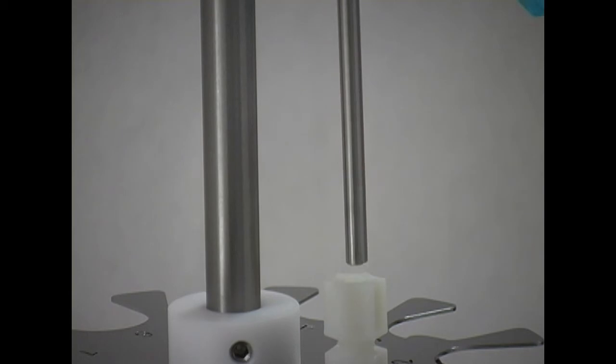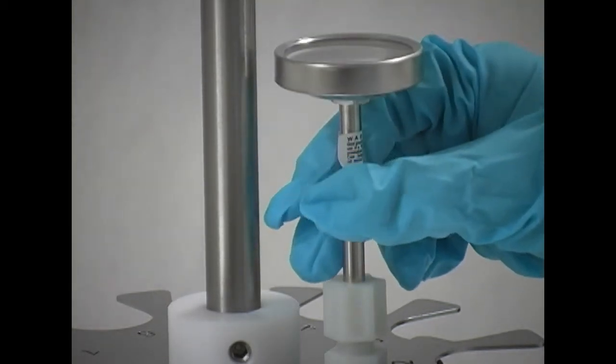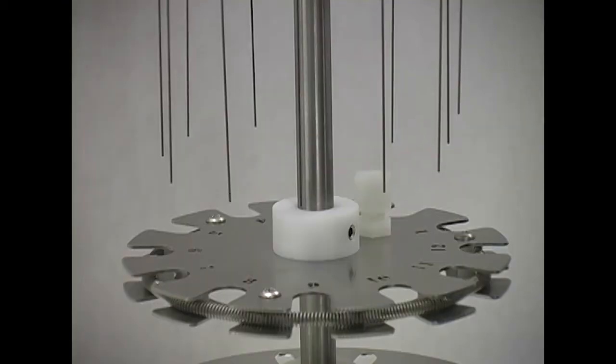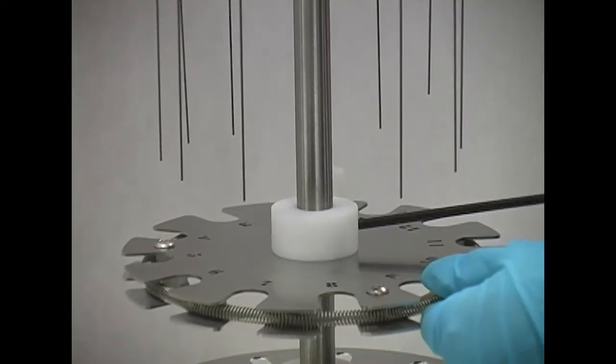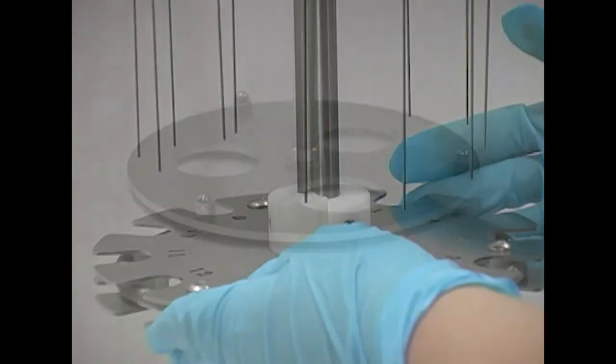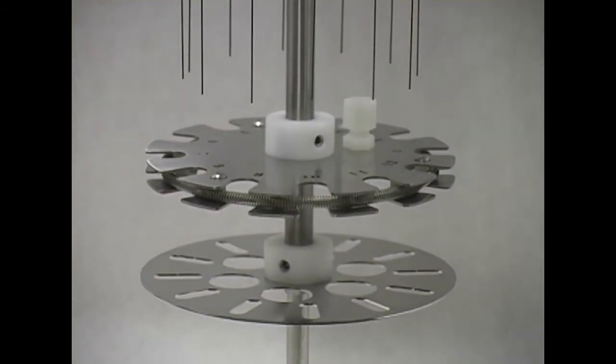Install the stainless steel thermometer into the fitting on the sample holder assembly and tighten the nut to secure it in place. Adjustments to the support tray can be made by loosening the set screws in the collar and moving it up or down. Raise the tray to the desired height, align the slots on the tray to match the test tubes, and re-tighten the set screws.